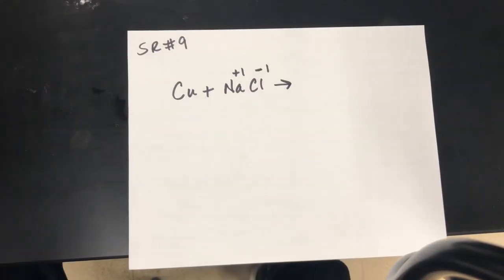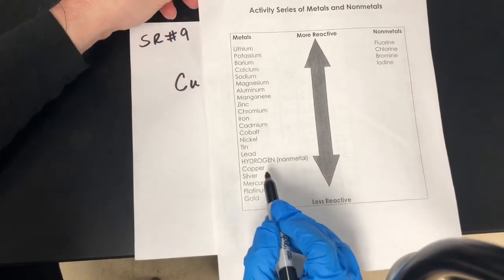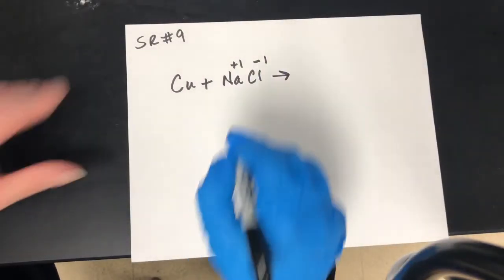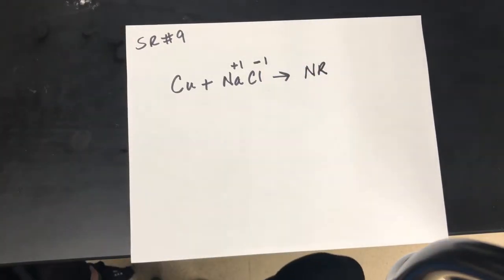So I'm going to look at my activity series, and copper is down here, and sodium is way up here. So that copper is not going to kick it out, so there's going to be no reaction. Okay, so we'll come back in just a second just to verify that there's no reaction in real life.